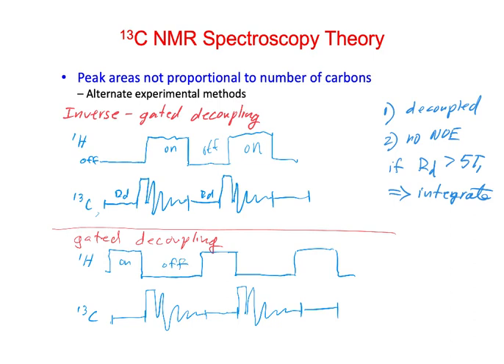Okay, so what's the effect going to be here? What's our spectrum going to look like? NOE, but coupling. Right. So it would be coupled. So is it decoupling, gated decoupling, or gated coupling? Because it's coupled. I think it's still called gated decoupling, but good question.